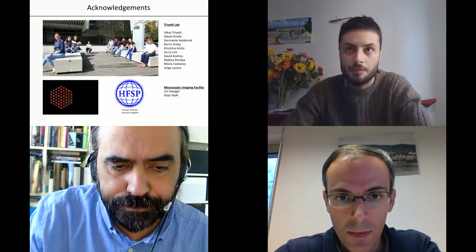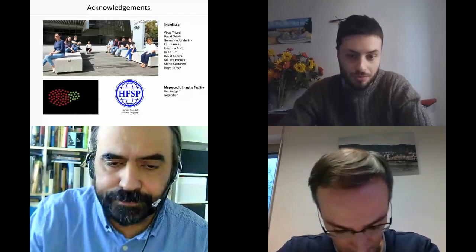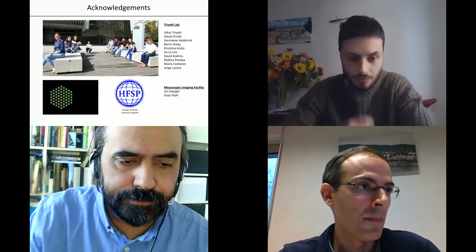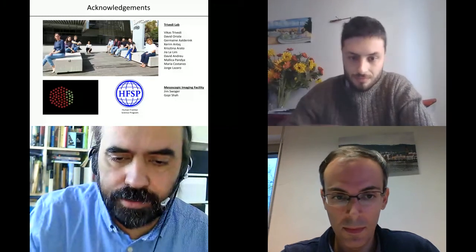So typically, it would be possible in case there is a microfluidic device integrated or coming on top of the microscope, but this, of course, goes beyond. It goes more towards the custom microscope build. Okay. Thanks, Nicola. For time reasons, I think it's better if we move on, and then at the end of the workshop, we can have some more time for questions.